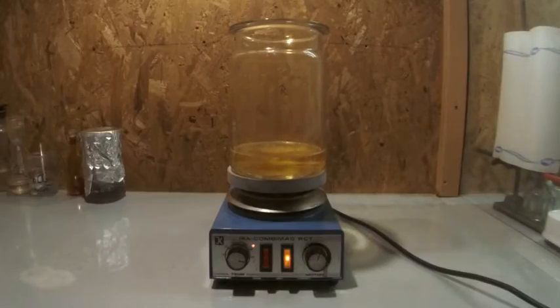I did this by simply heating it on my hot plate stirrer. When heated, the mixture gives a lot of dissolved NOx into the air. Also, some of the still unreacted nitric acid is decomposing and also producing nitrogen oxides. So be careful.